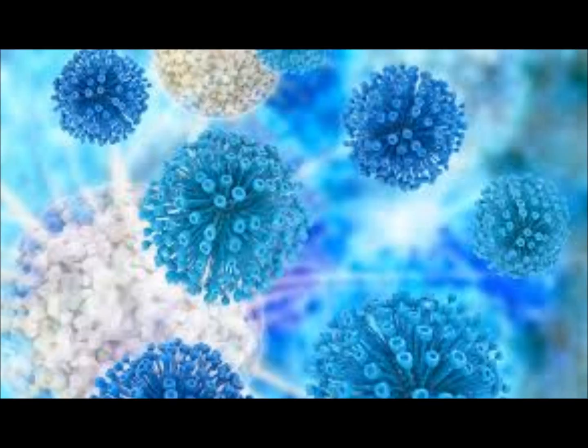The blood agar. And what did you look for on that? Hemolysis, and then what did you do? Did you look at anything else on the colony? Oh, the size, for sure, and color. If you can't get anything better yet, at least try to put size, color, and hemolysis. And it's always on the blood plate, okay?